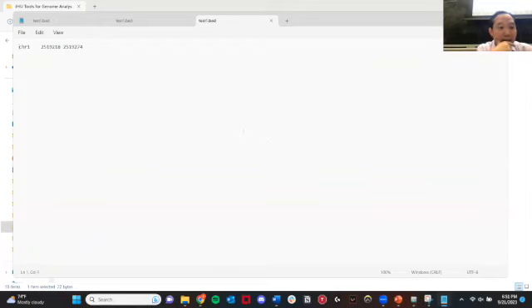Yeah, can you actually copy this? Can you show me, move it, go to the chromosome 1. Can you use the right arrow key? Yeah, good. It's a tab. That's good. And then is there another tab or right?